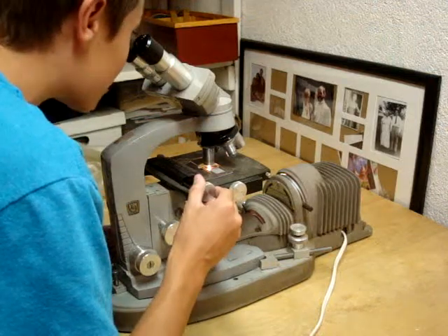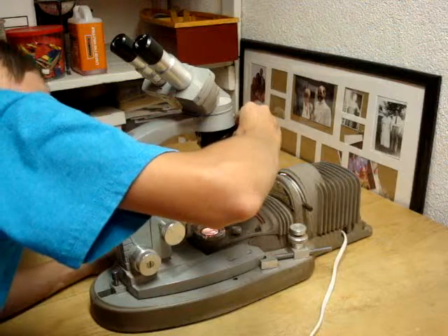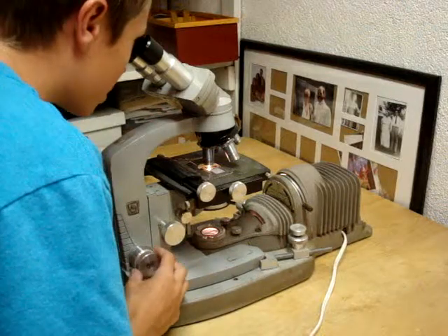And then after it's focused on that, you can then switch to that objective which is right there.